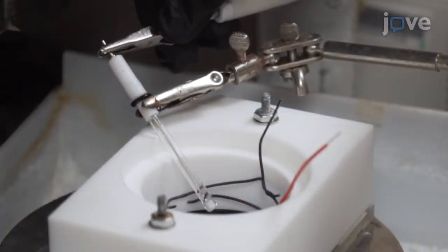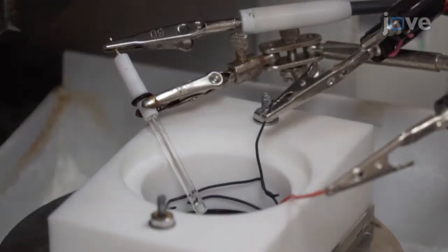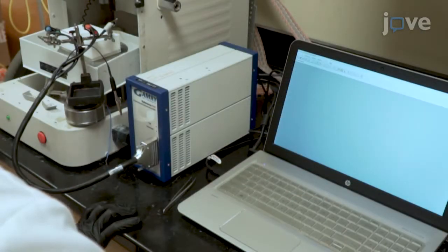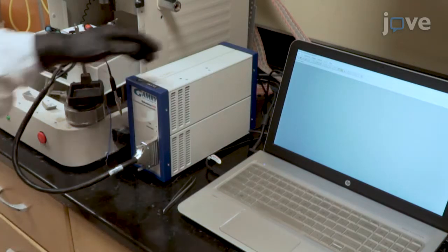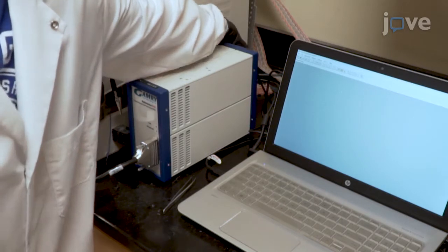Connect the electrodes with the potentiostat, taking care that the electrodes are not touching, and open the electrochemical software package that interfaces with the USB-controlled potentiostat to turn on the potentiostat.